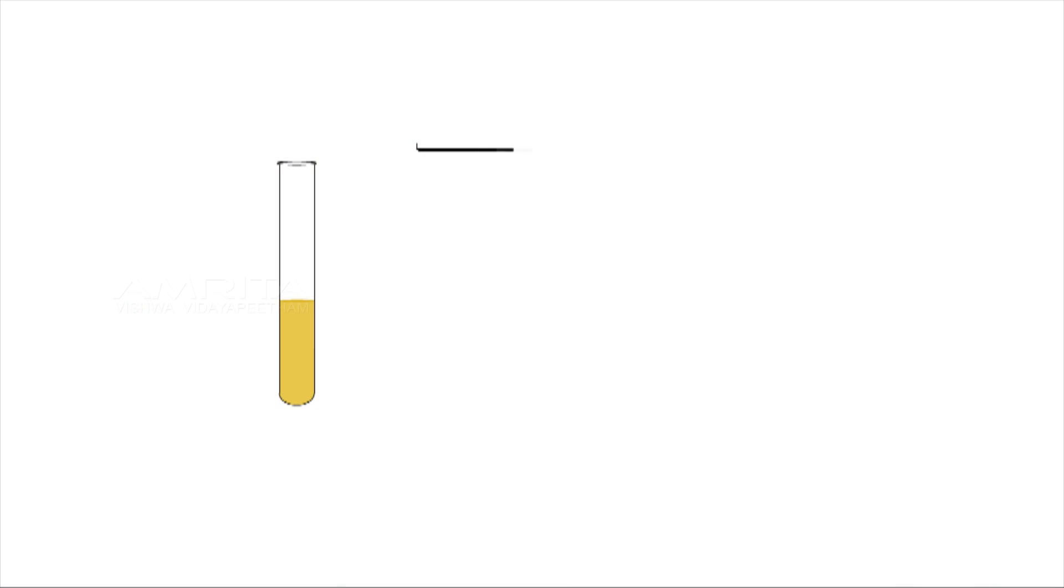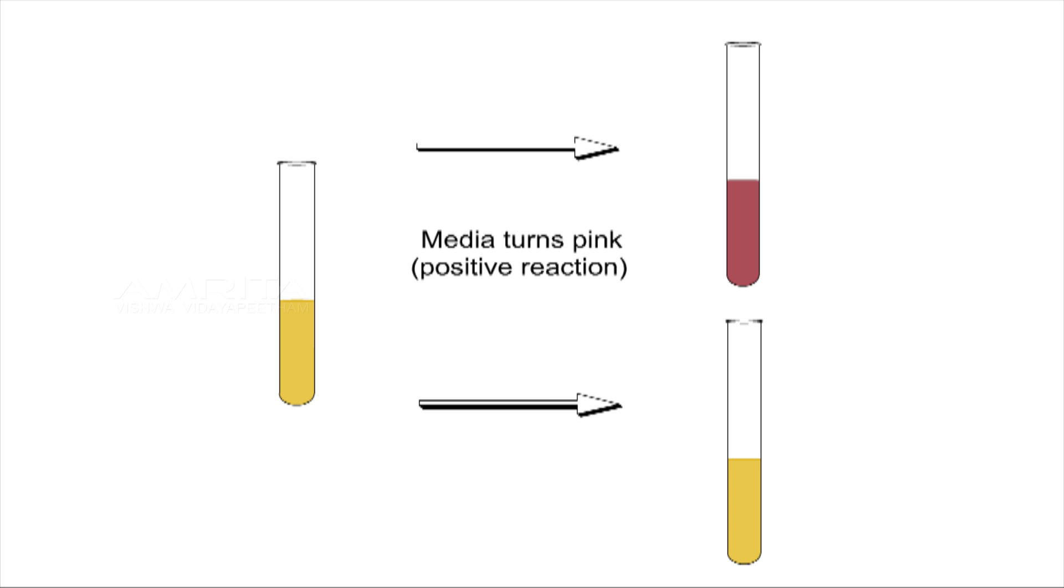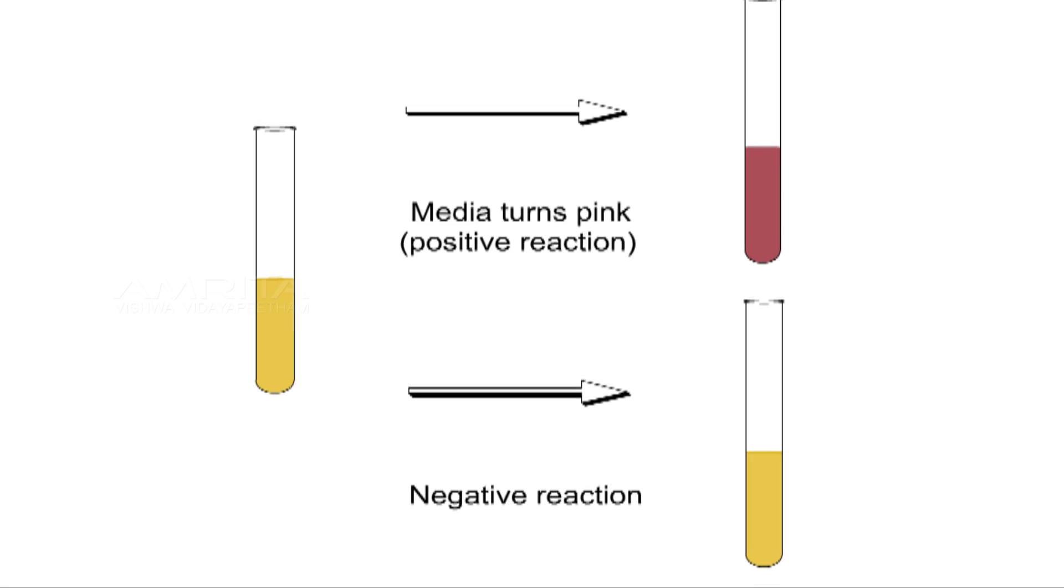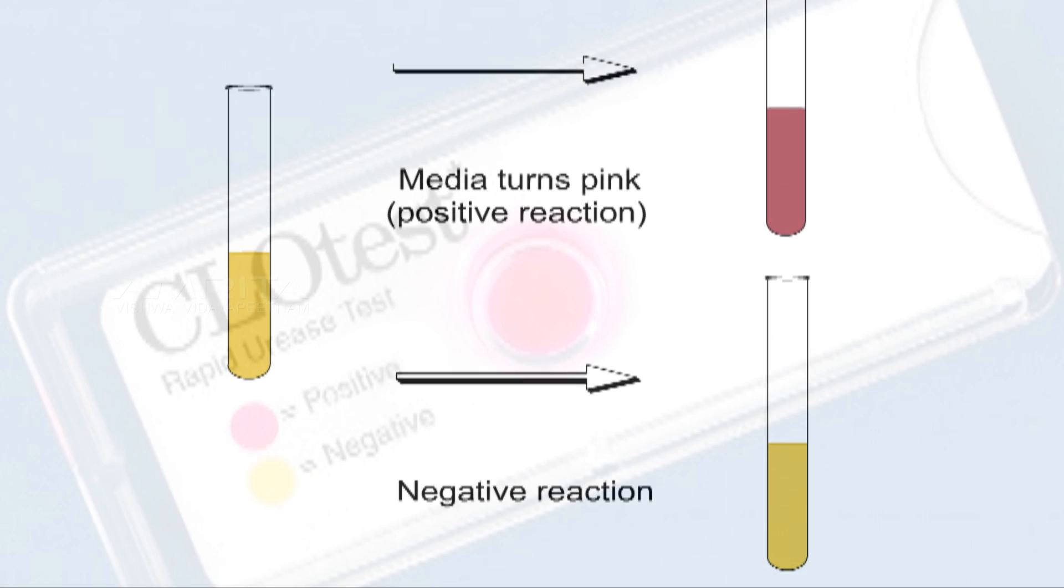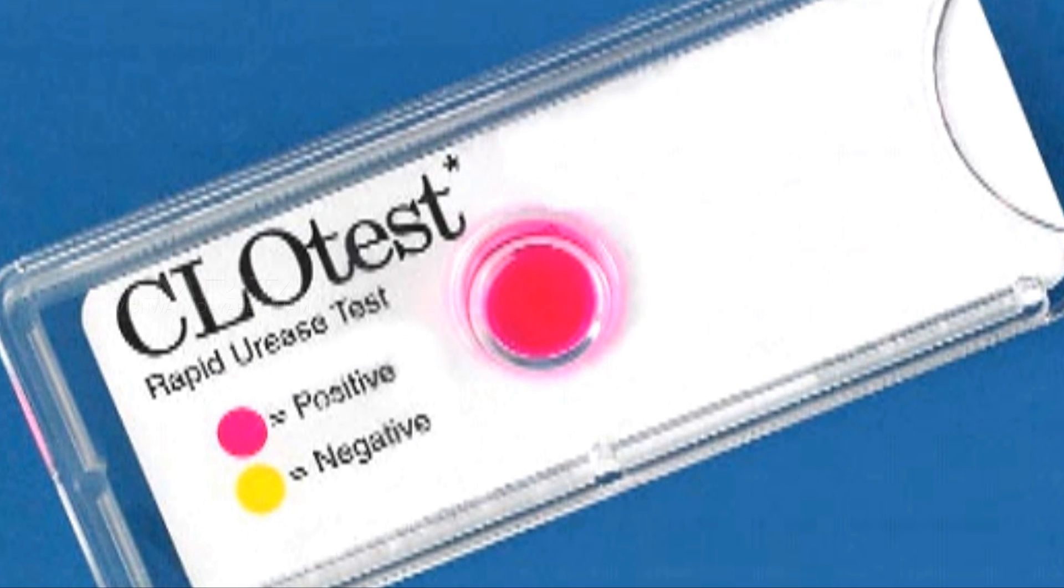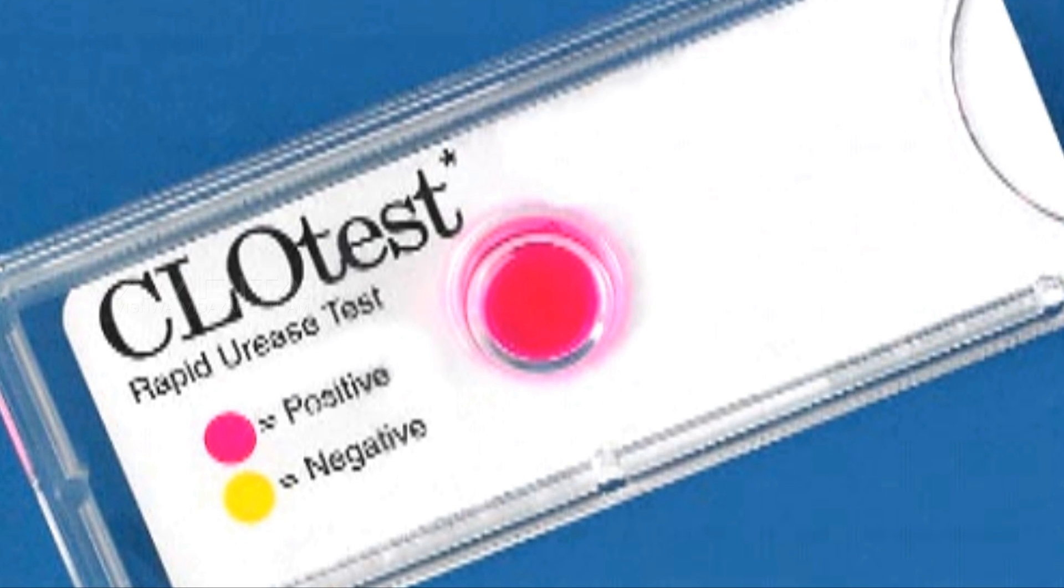If the urea in the medium is degraded and ammonia is produced, an alkaline environment is created and the media turns pink. This is a positive reaction for the presence of urease. Failure of deep pink color to develop is evidence of a negative reaction.